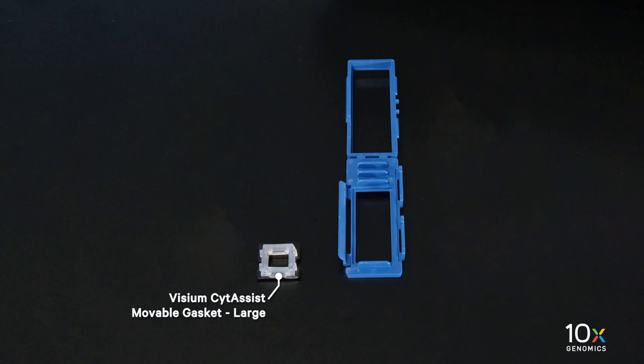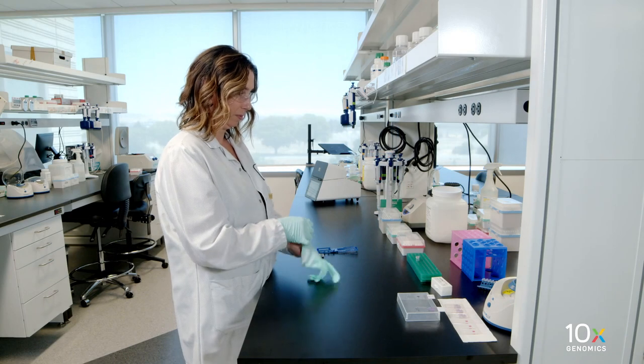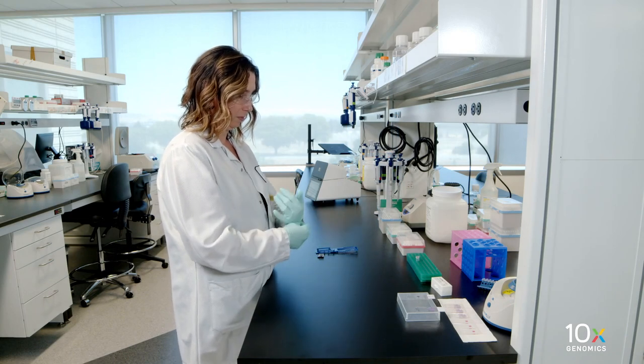First, we will assemble the Visium Situs' Tissue Slide Cassette 11 millimeters. We have the Visium Side Assist movable gasket large and the Visium Side Assist movable gasket frame. Wear fresh gloves while assembling the Tissue Slide Cassette.